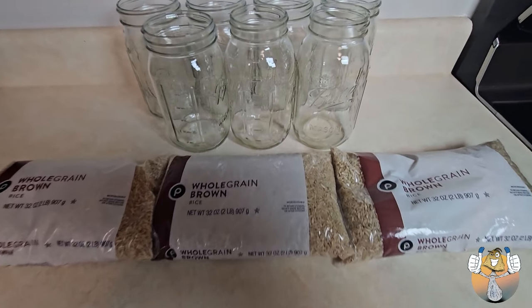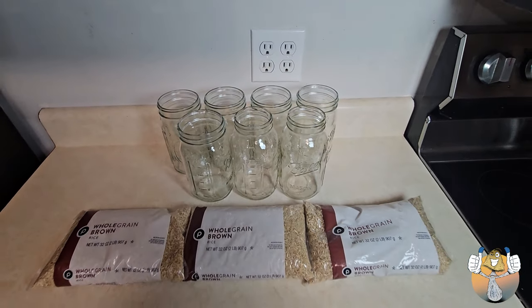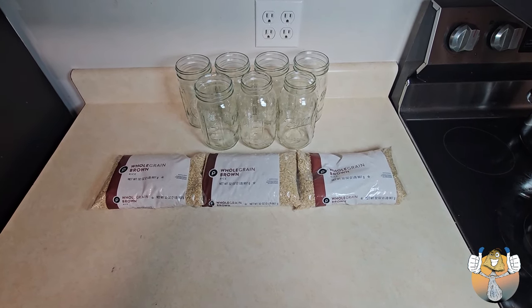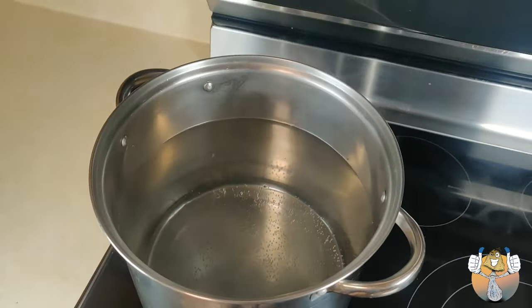Okay, to start off, we have three 2-pound bags of whole grain brown rice, and we are going to prep, dry, jar, and pressure cook our rice and prepare it for whatever inoculation we choose.